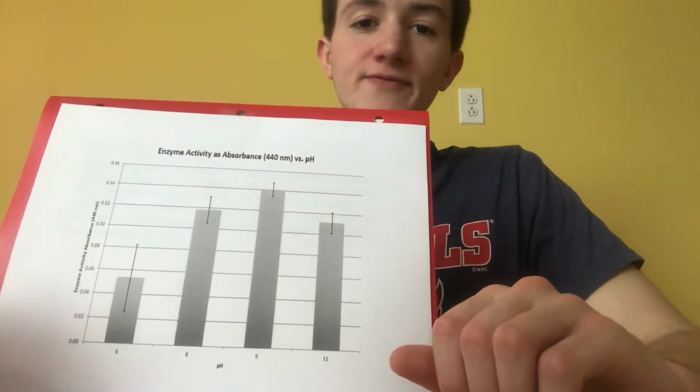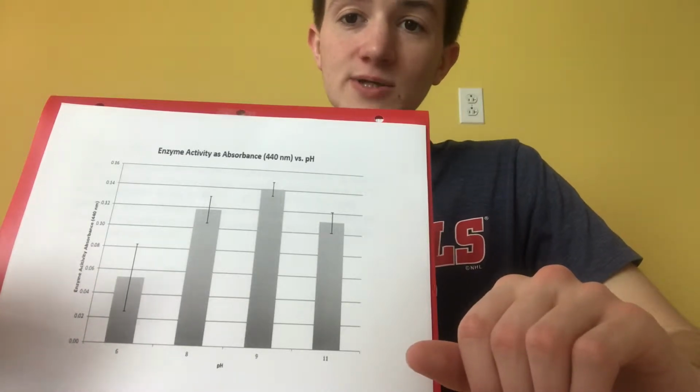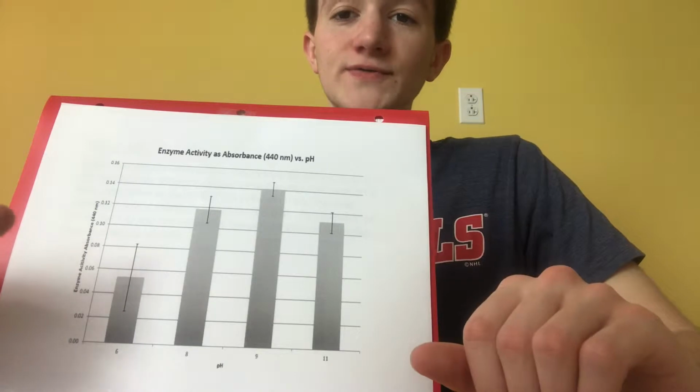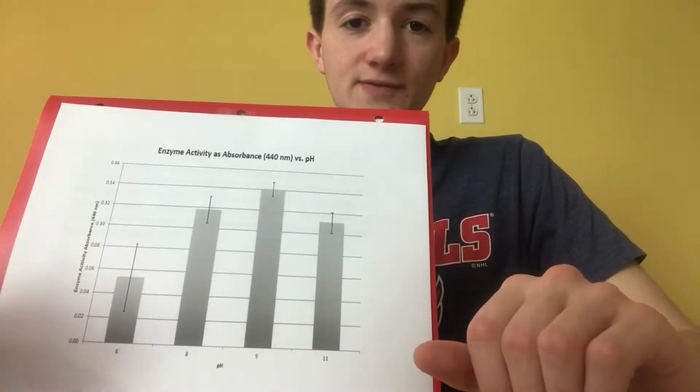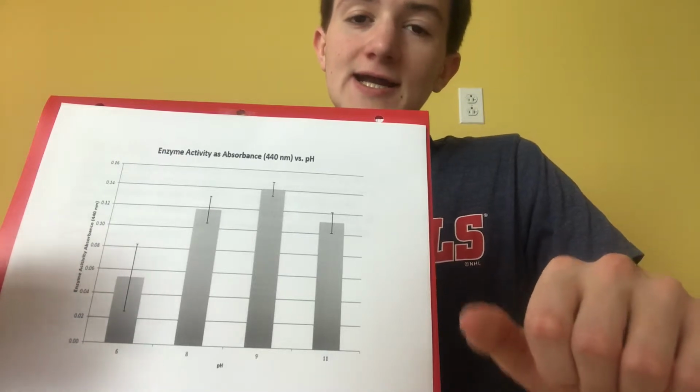So this is our graph. We chose a bar plot graph, and we compared the enzyme activity as absorbance measured at 440 nanometers compared to the different pHs we chose. And we chose pH 6, 8, 9, and 11.